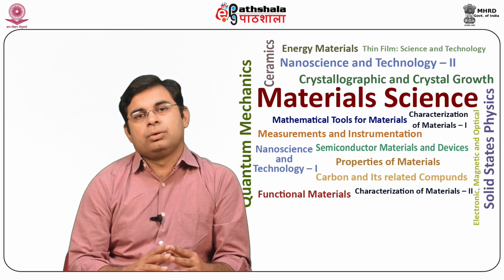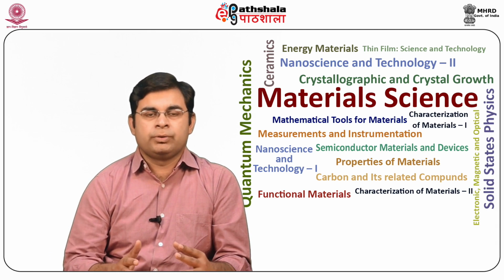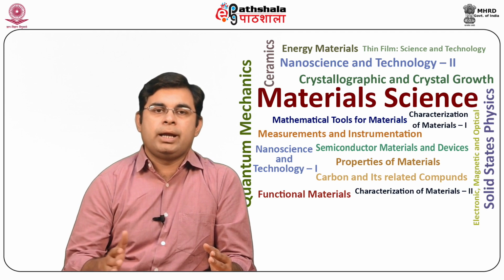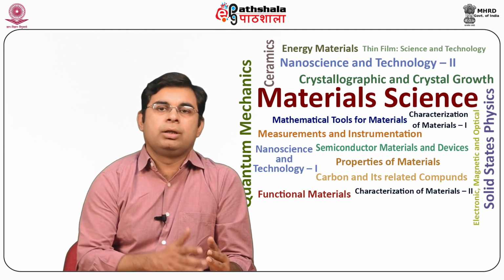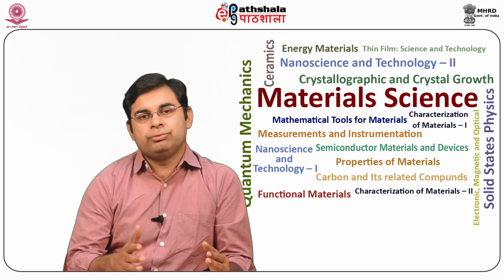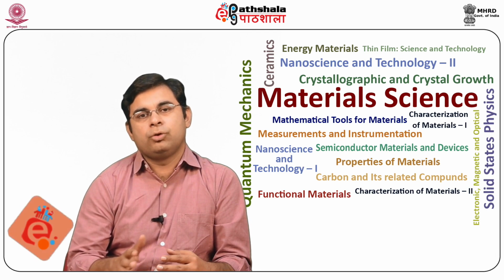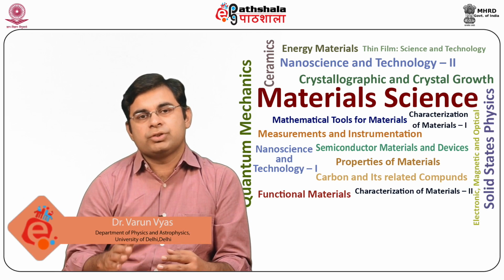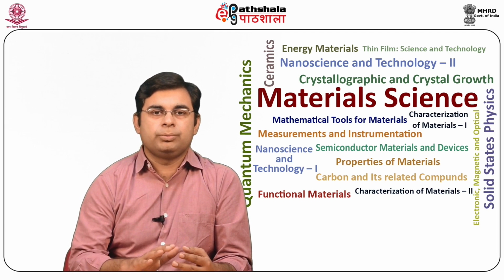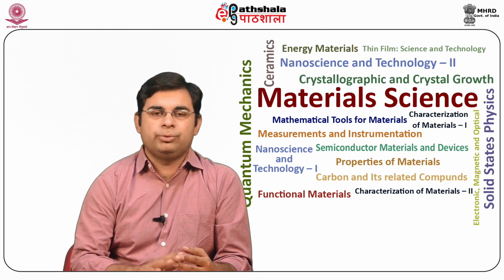In this module, we studied two most important types of spectrophotometric methods. First, we studied UV visible spectrophotometry, and we briefly studied Beer's law that describes the absorption characteristics of molecules in the path of the UV visible radiation. Second, we studied infrared spectrophotometry, where we studied different types of molecular bending vibrations responsible for absorption of radiation at a particular wave number or frequency.